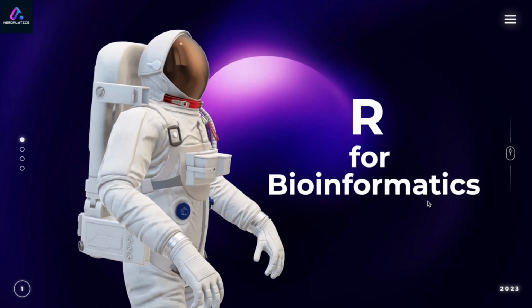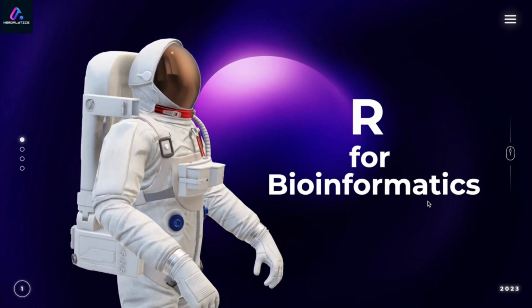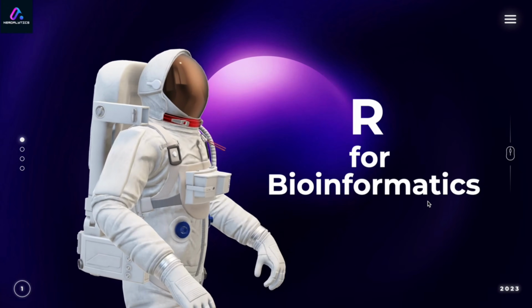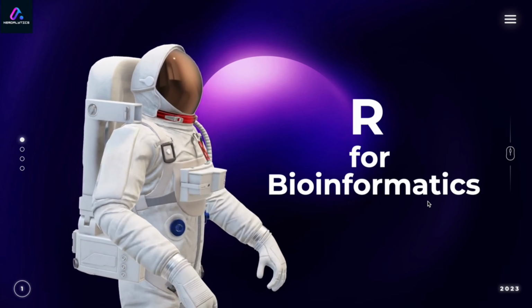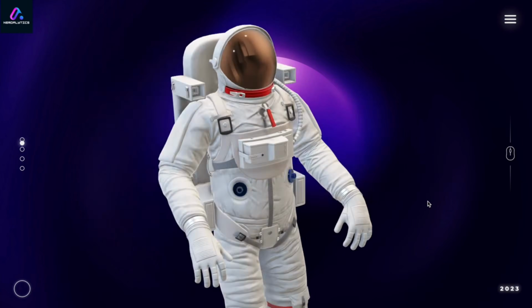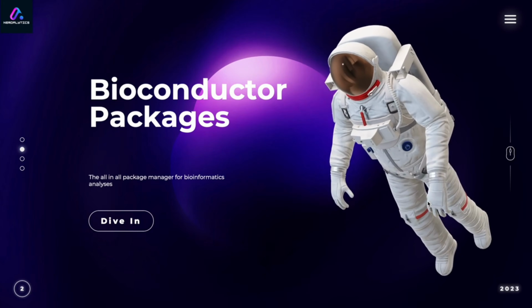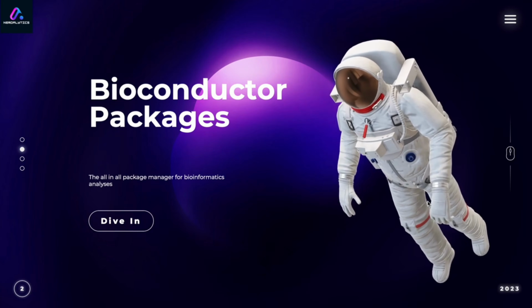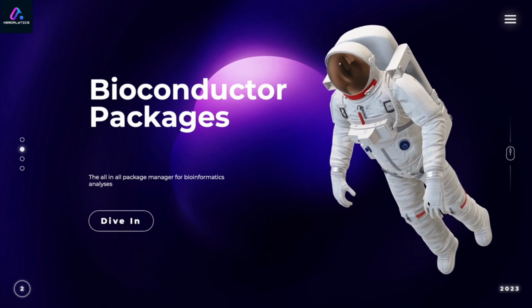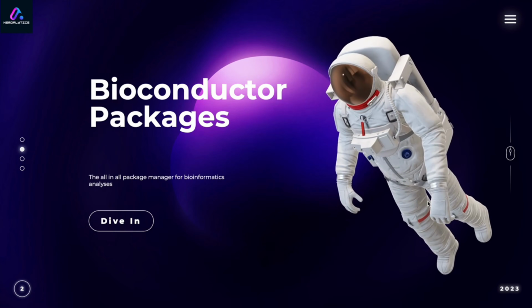So today we are diving into one exciting and incredibly useful topic in the world of data science and bioinformatics, that is R programming. So basically what we are going to do is use different packages from Bioconductor, and we are going to install many Bioconductor packages which are useful for bioinformatics analysis, such as RNA sequencing, single cell RNA sequencing, even proteomics analysis, mass spectrometry analysis, etc.